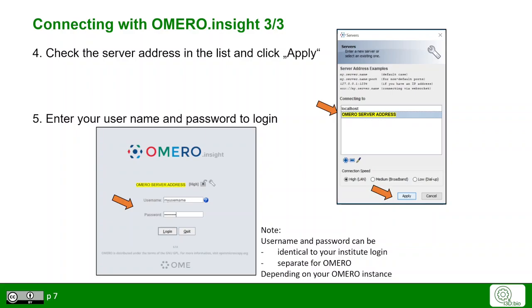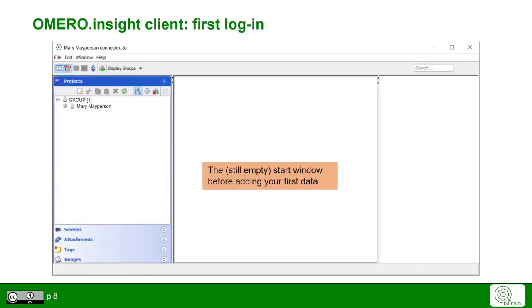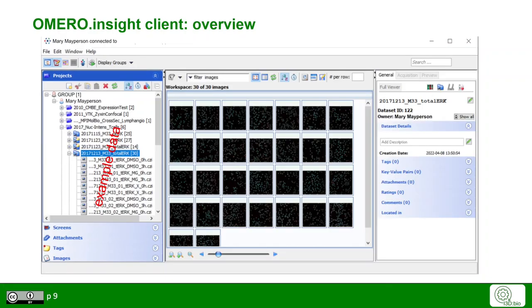Please note that your username and password are depending on your Omero instance and your institution. It can be identical to your institute login or it can be a separate login for Omero. When you first login to Omero, it will look pretty much empty. So let's take some example data to get an overview.